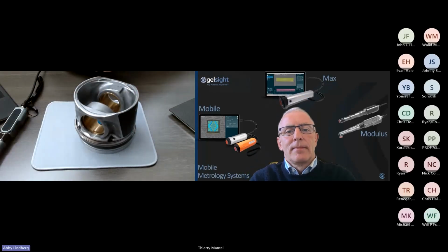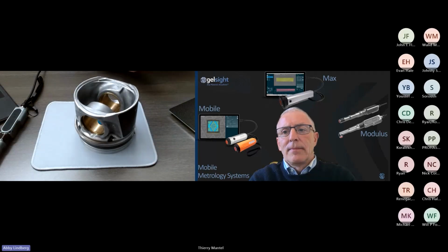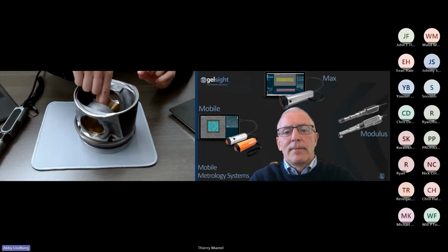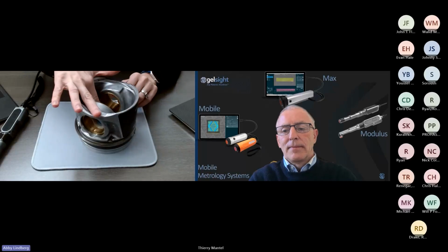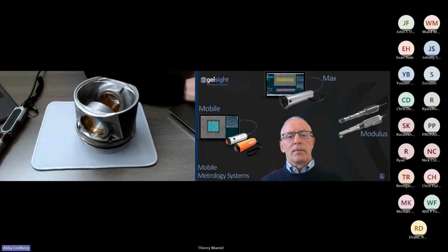And we found that when we're making molds or replicas, we sometimes get a few air bubbles, and minimizing them can be done a little bit with a piece of plastic or something pressing down onto the surface. That can help with our repeatability. So I just press that onto the top, and we'll let this sit and cure while we talk a little bit about how GelSight works and a little more detail about GelSight with replica.